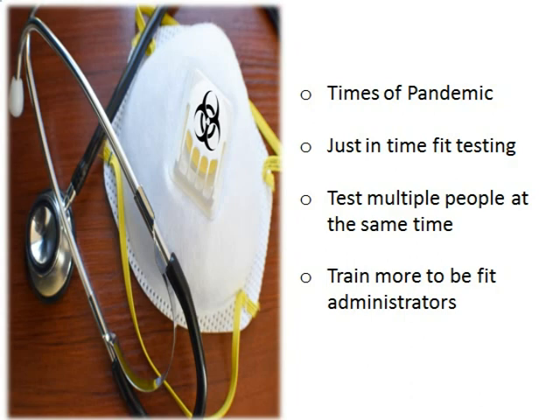The first thing to understand is that the number of fit testing kits purchased should not be based on the number of fit tests that can be conducted per kit. The number of tests is primarily limited by the amount of fit testing solution available. Many suppliers provide kits using saccharin and Bitrex in a 55 milliliter bottle of strong solution. A 55 milliliter bottle is advertised to test 150 people. However, nebulizers need to be emptied, rinsed, and refilled every 4 hours. This decreases that number significantly, and facilities should consider ordering extra solution.